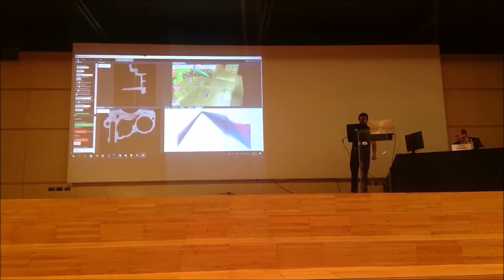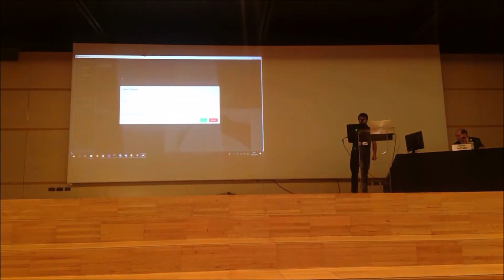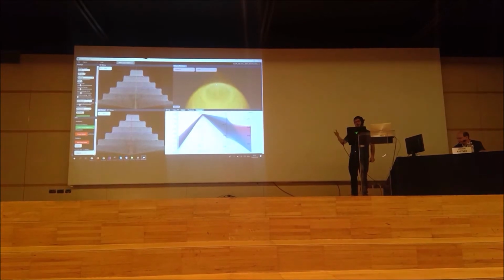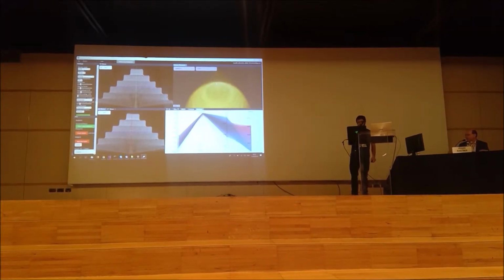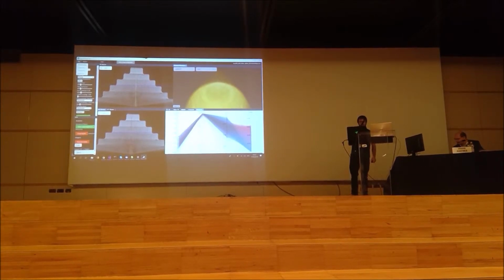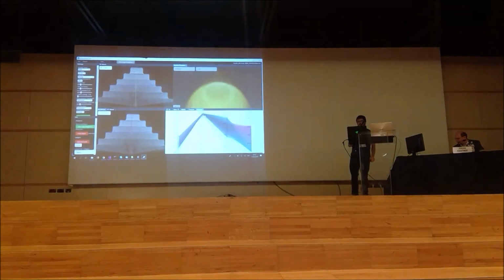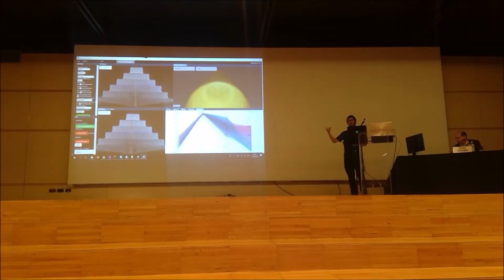Let's now switch to this nasty data set I talked about before. Load the data set. This is now 1000 times 1000 times 500 boxes. And here we have again our nested data set. What we can do now is, again, we run the segmentation process, which basically is rather simple because it only uses this single threshold, which defines how likely we would like to merge neighboring regions.